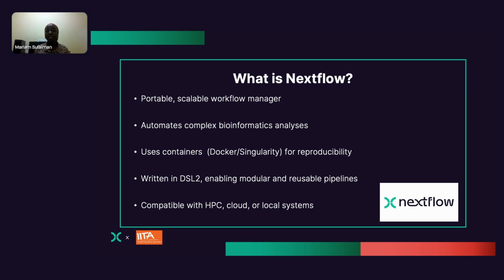It uses containers like Docker and Singularity for reproducibility, and these containers have pre-installed libraries and packages. It is written in its own domain-specific language to run the processes, and this enables modular and reusable pipelines. Also, it is compatible with cloud and local systems.